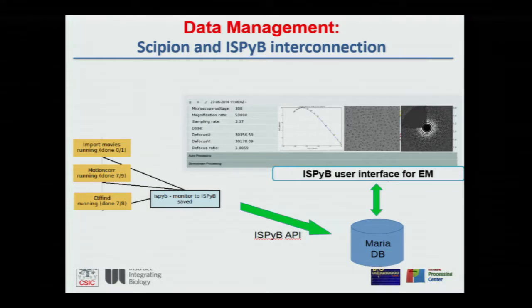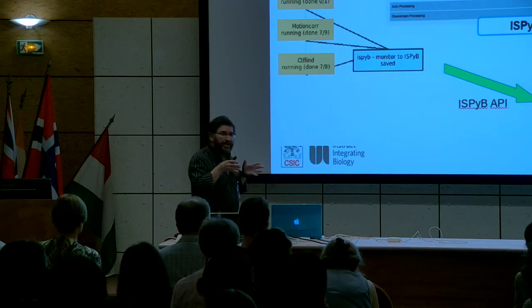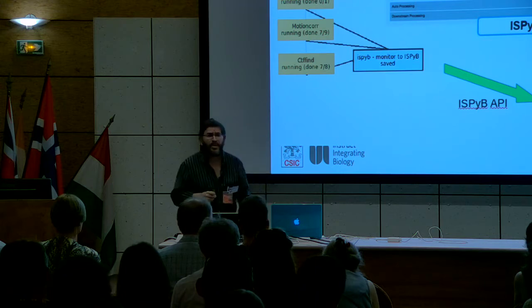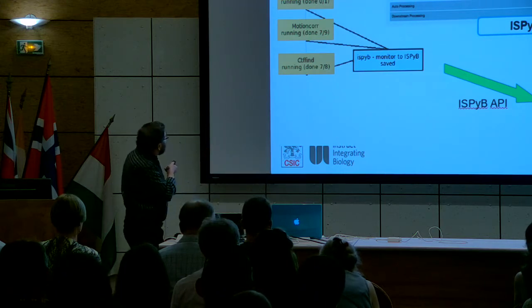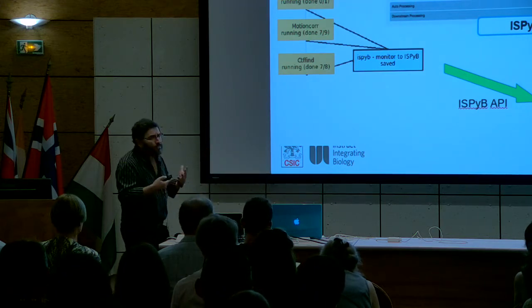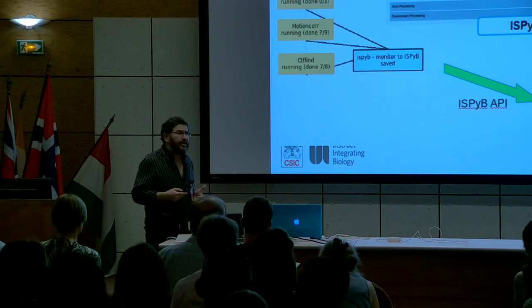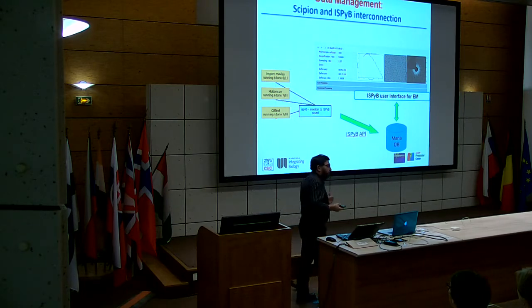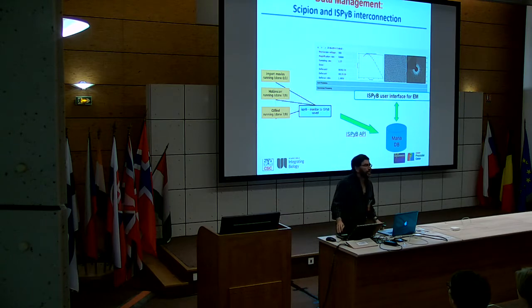What you see here is how it's being used in Diamond. And ISPyB is very nice to talk about in this context because it was actually a collaboration between the ESRF and Diamond. So what we do is all the pre-processing steps, the ones that are done at the facility, are dumped into ISPyB, and then ISPyB's normal web interfaces are used to present the data to the user.